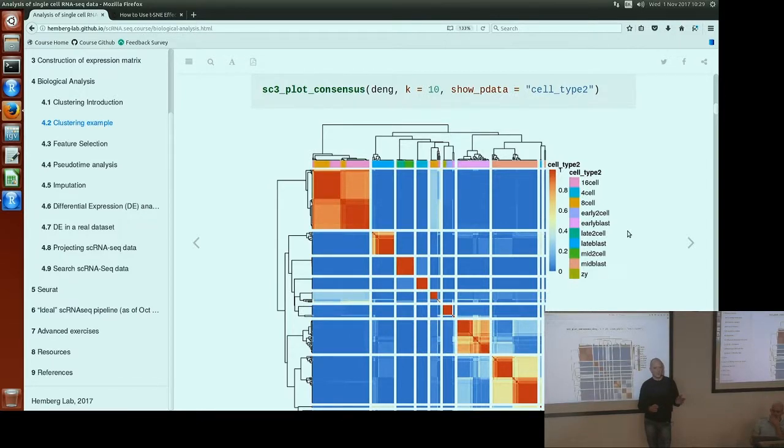Here we perform distance calculations. We have several distance measures, and this makes some internal scaling of the data, so you don't just run it on the raw data values. I'm not sure whether it makes data more spherical. It should, I suppose. But if you don't believe in k-means, then you probably should use another clustering tool. Every clustering algorithm has some assumptions, right? But you can always run it and see what happens on this particular data set.